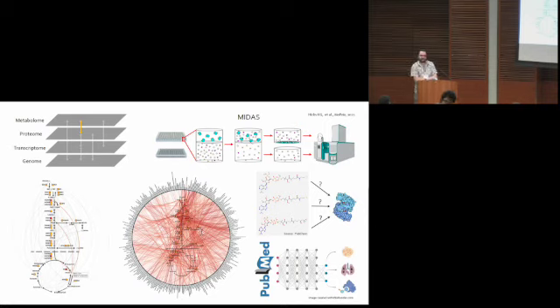Yeah, I mean, this is, in essence, a screening platform, too, where they've done a lot of, with these hits that are statistically enriched, a lot of thermal shift assays to demonstrate that it is actually interacting, as well as some other validation experiments.